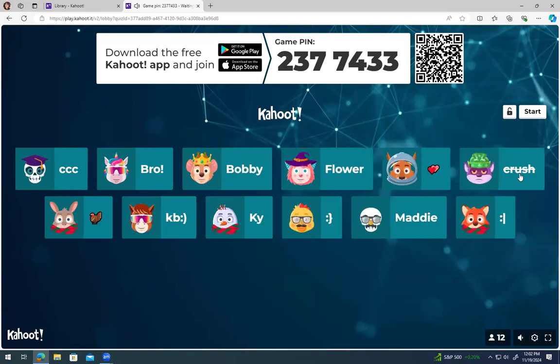This one is blue. So that's our first stop there. If you completely break down all the proteins, then this one, we start seeing transparency. Let me do this. Which we call digestion, because we completely digested all the proteins.